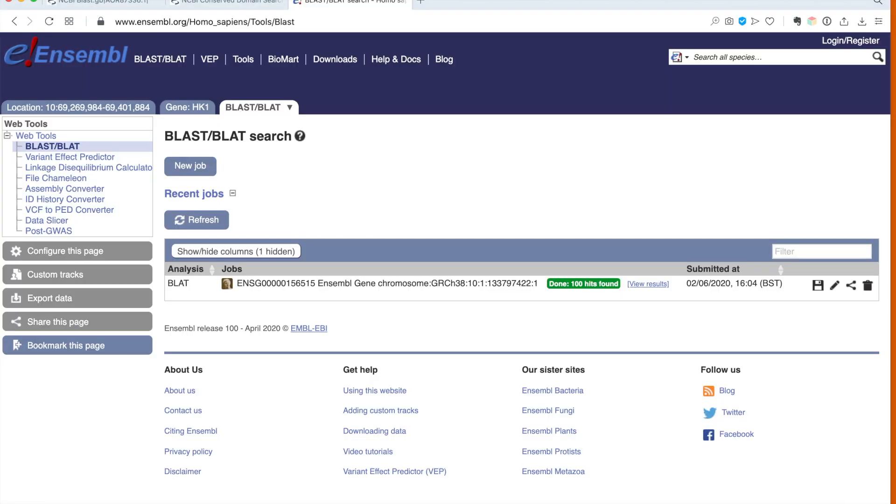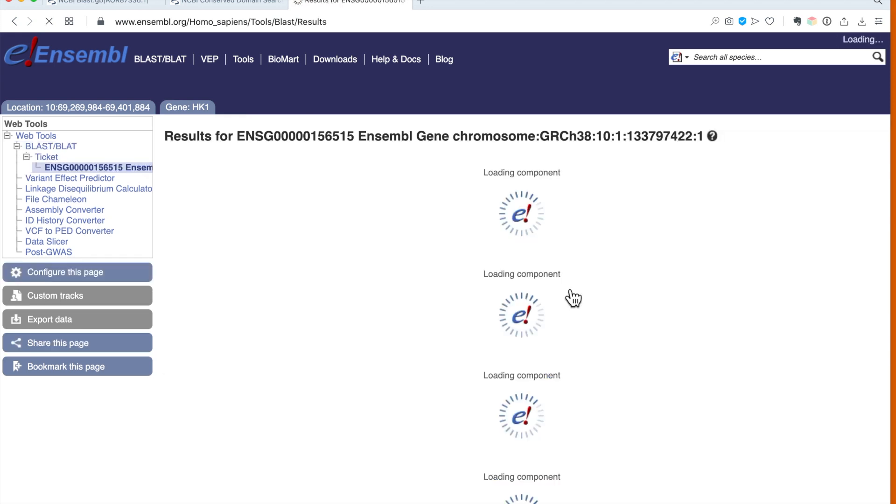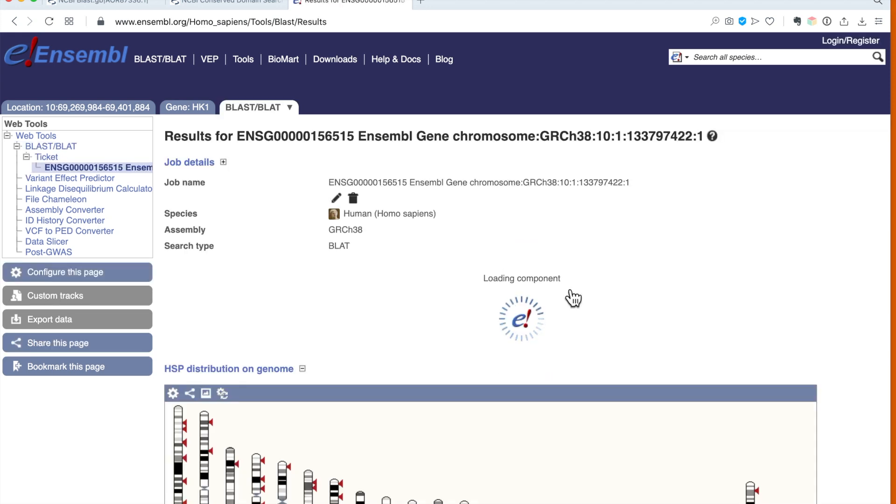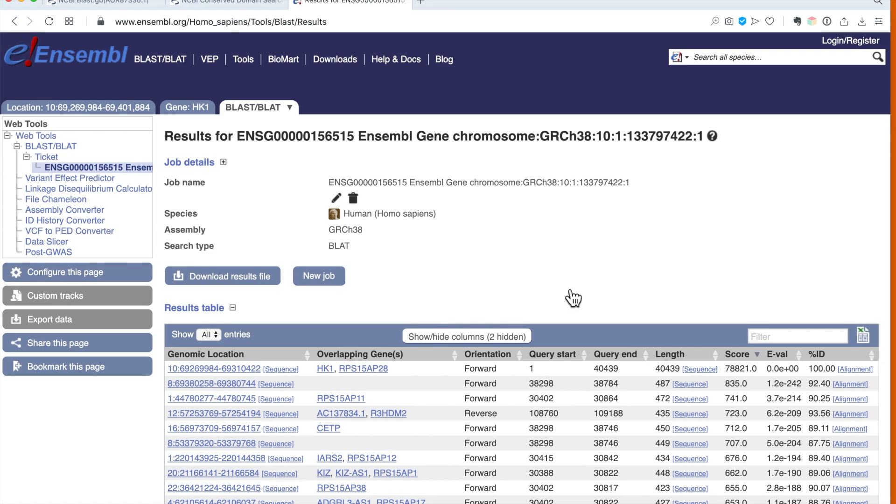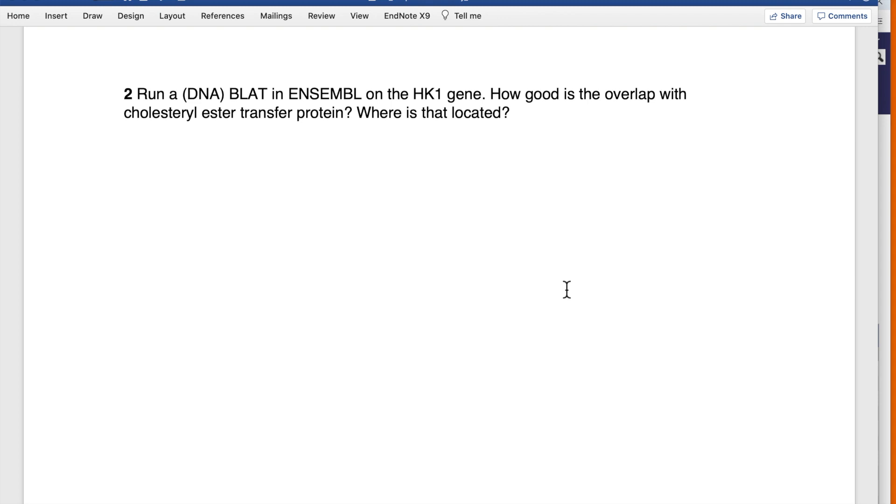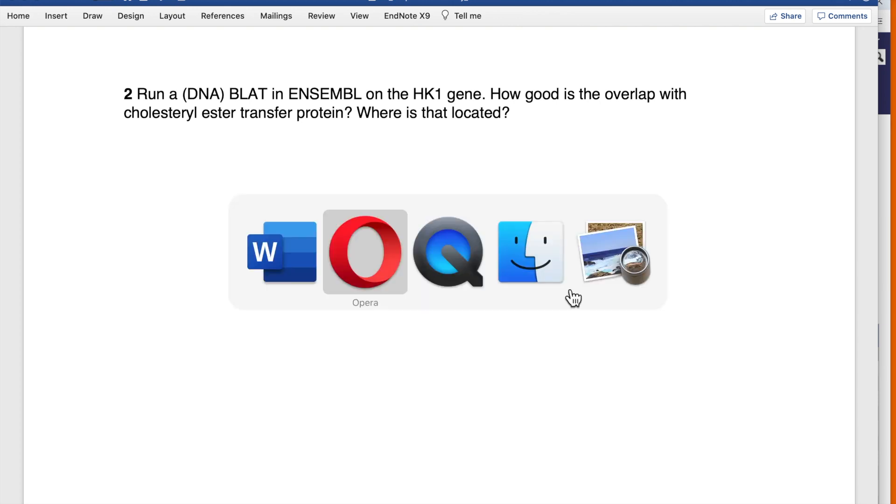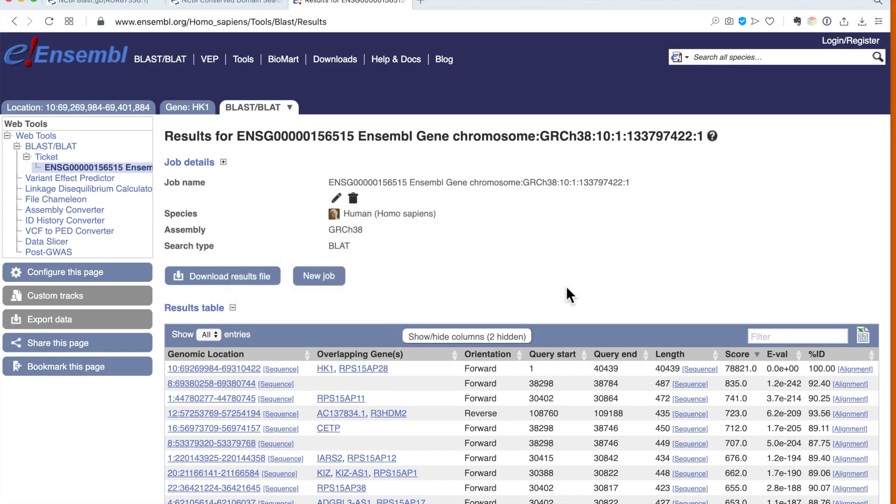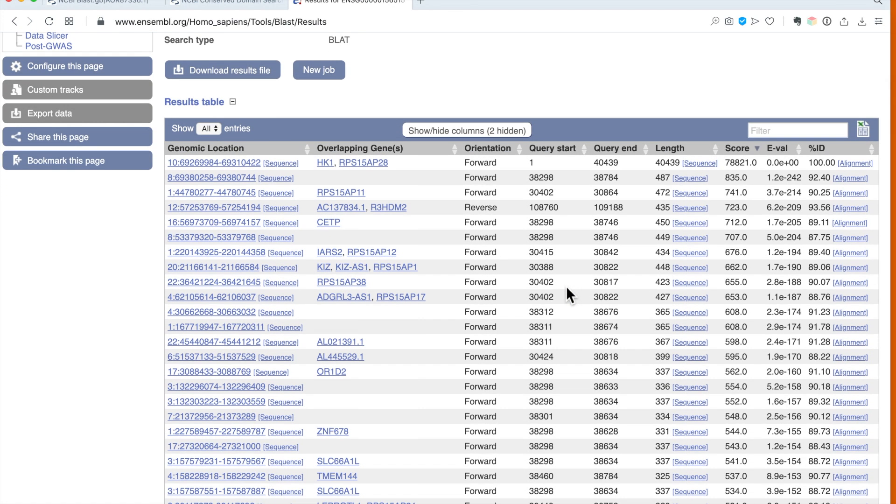Okay, our search is finished. We can see here in that green box we have 100 hits. Clicking on it will give us a list of those hits. The question was: how good is the overlap with cholesterol ester transfer protein? We search for cholesterol, but with a little bit of imagination we can imagine that CETP is the one we are looking for, so we can click on it and see.